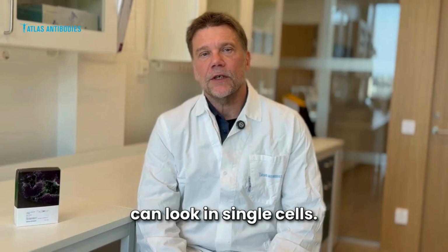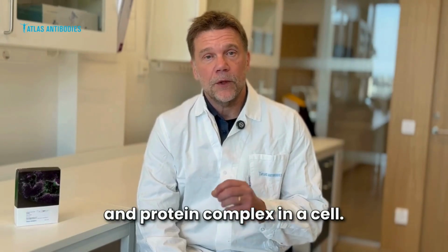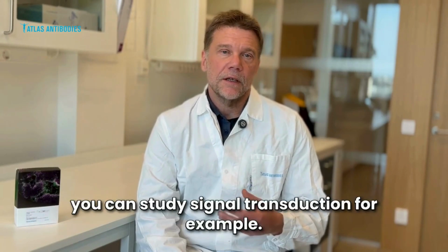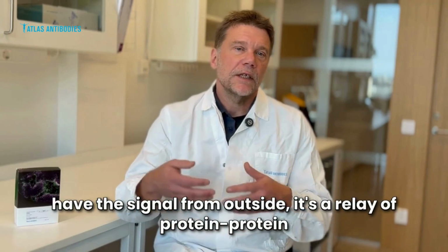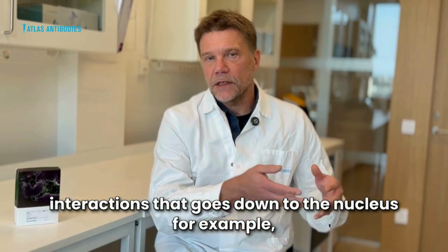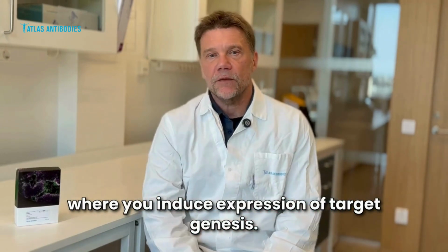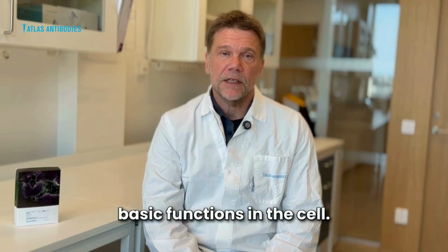MolBoolean has the advantage that you can look in single cells. You can see the amount of protein and protein complex in a cell. So that is a tool that you can use to study signal transduction, for example. If you have free protein and then you have the signal from outside, it's a relay of protein-protein interactions that goes down to the nucleus, for example, where you induce expression of target genes. So it helps us better understand basic functions in the cell.